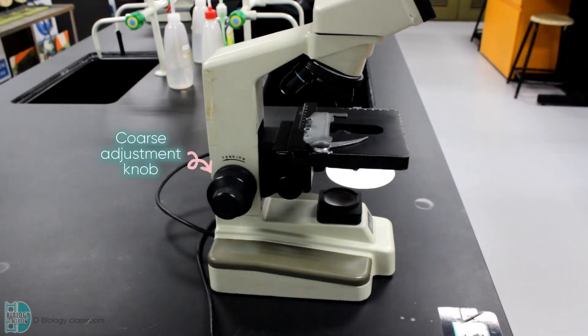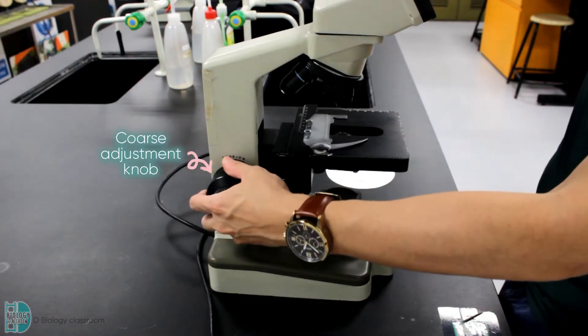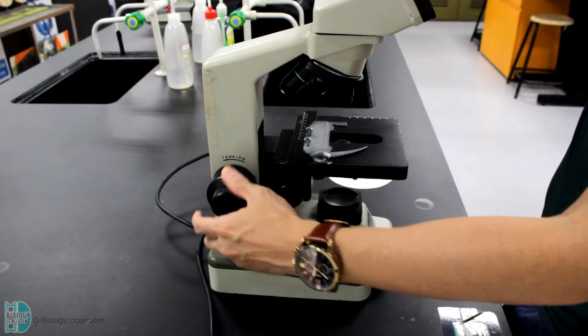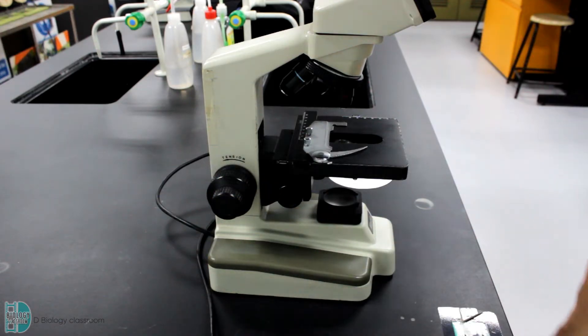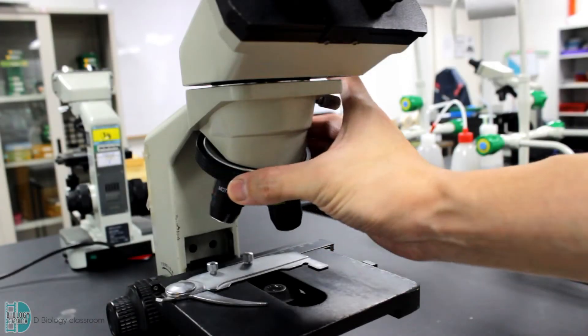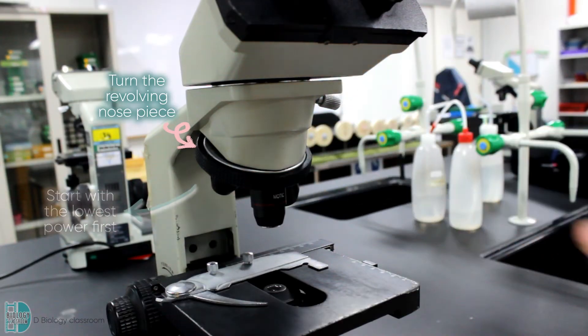Use the coarse adjustment knob to lower the stage. You should move it all the way to the lowest position before you start. Then, turn the revolving nosepiece to choose the objective lens with the lowest power available to you.